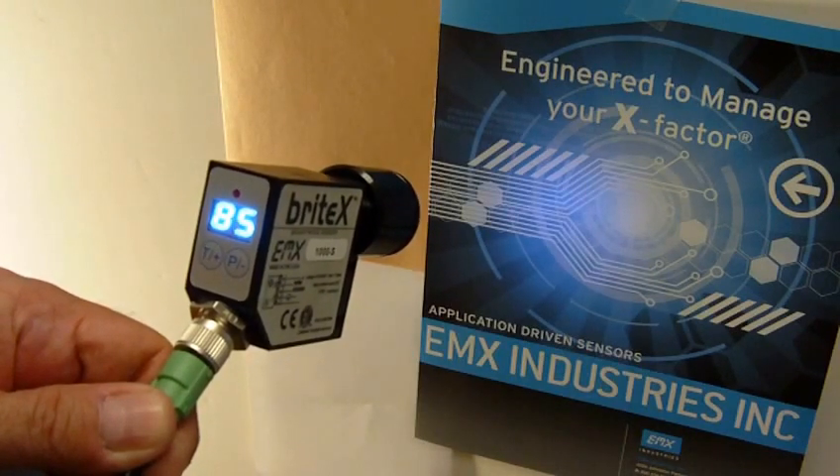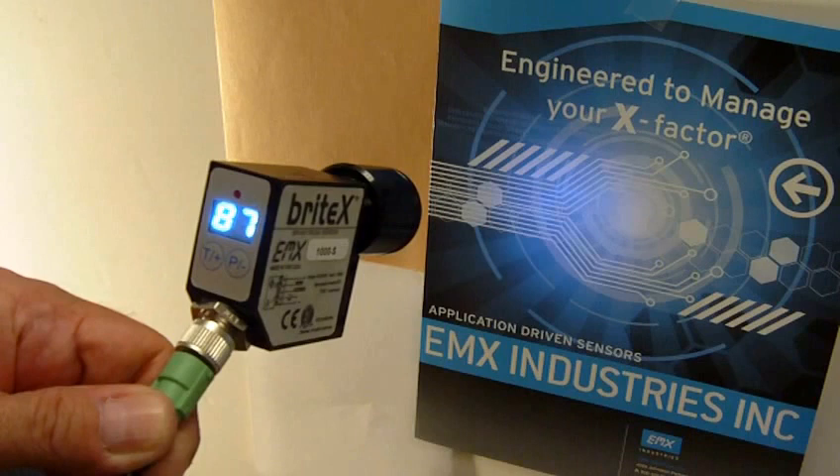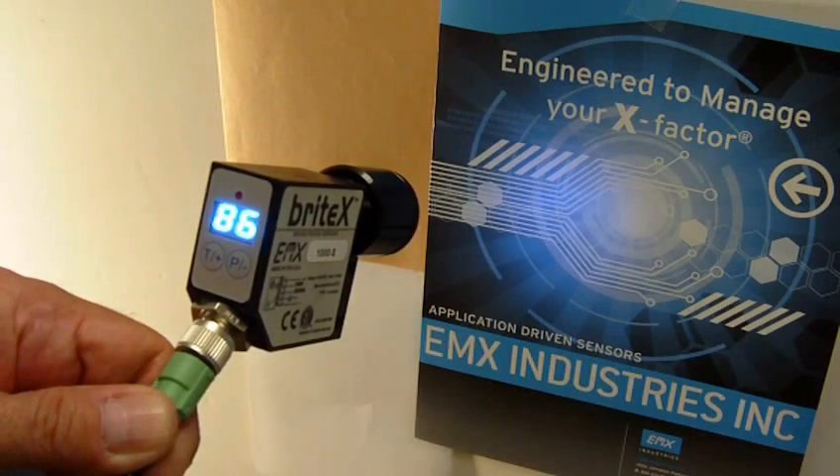The BrightX employs our field-proven patented technology for effective reflectance measurements of sugar. The monitoring of sugar color allows processes to operate in a more efficient manner while increasing throughput to meet market demands for high color quality.